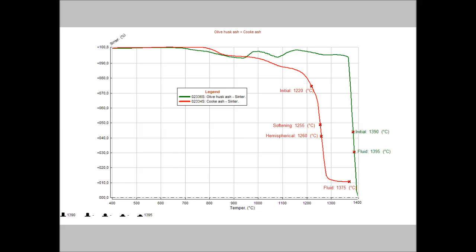This graph shows the result of the analysis on two samples of ashes using the standard ASTM-1857. As an alternative, it is possible to carry out the analysis according to the standard DIN-51730.